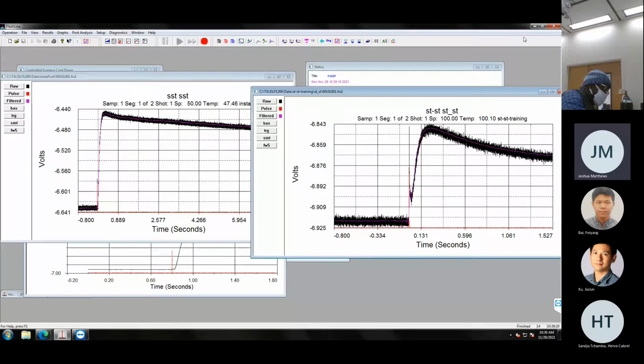If you don't, you can't load a liquid sample into the sample holders that you have now. It would just fall right onto the laser optics, right? There's no bottom to the sample holders that you have. Exactly. There is no container. We'll get you in touch with the applications folks. They'll be able to help you out with getting the necessary tools to do that.